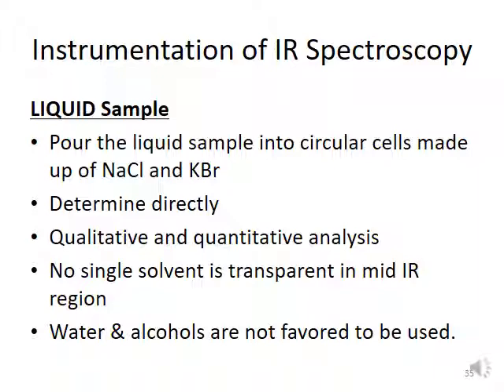In infrared spectroscopy, we can determine it qualitatively and also quantitatively. Here, no single solvent is transparent in the mid infrared region. In this liquid sample, water and alcohols are not favored to be used. The reason behind this is what I explained just now, because of the OH.